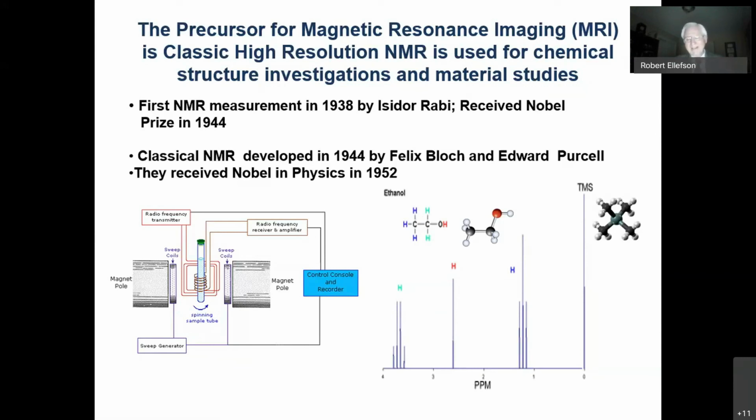ethanol. So anyway, the hydrogen atoms, the blue ones on the left, are associated with this shift. The one on the oxygen atom is here, and the ones on the two hydrogen atoms on the central carbon atom are there. So those are small deviations, like 2 to 4 parts per million. But it can be used in order to determine chemical structures.